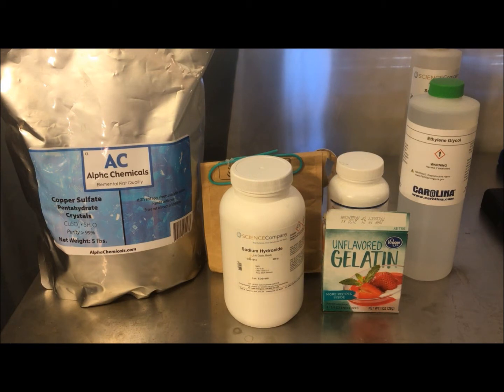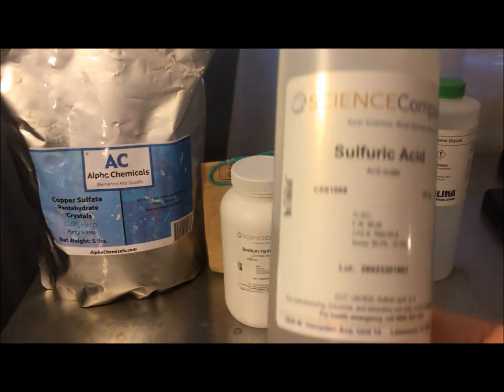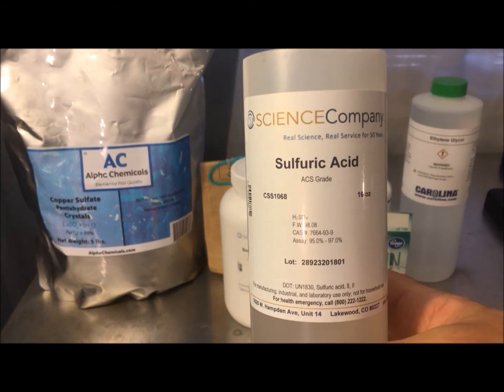You can also use it to control the pH of the reaction solution along with sulfuric acid. Some of the studies suggest a neutral pH around 7 makes the smallest particles.